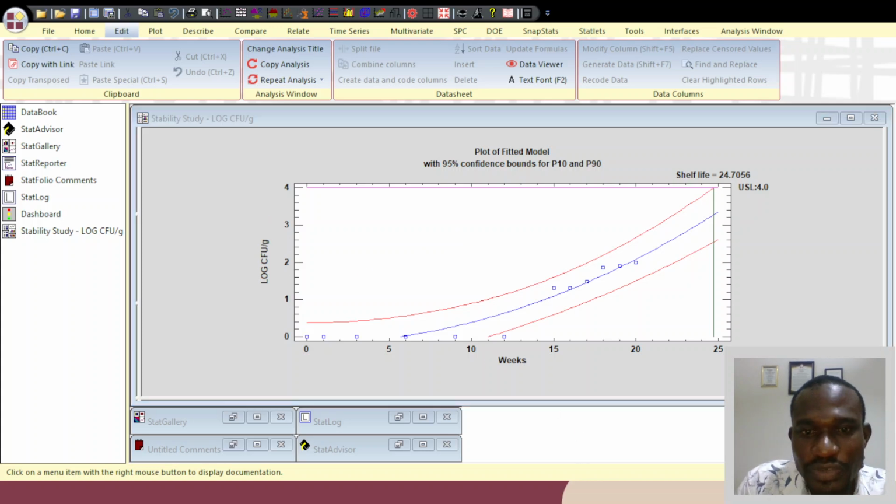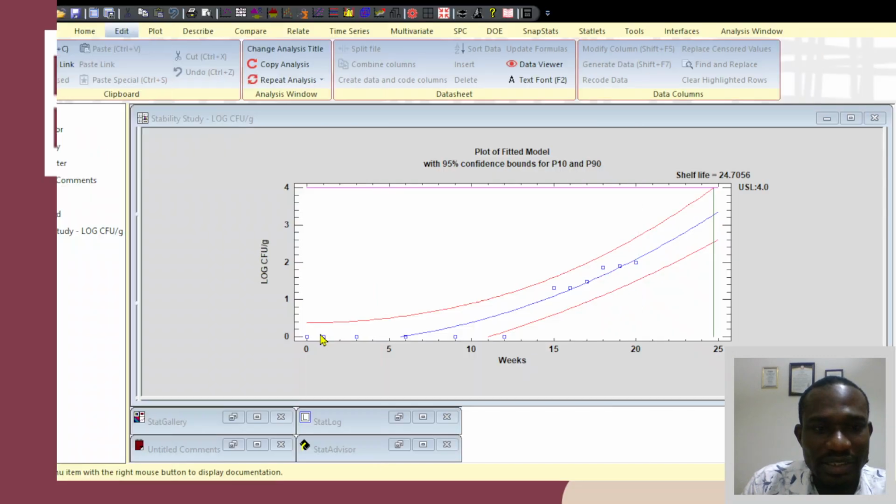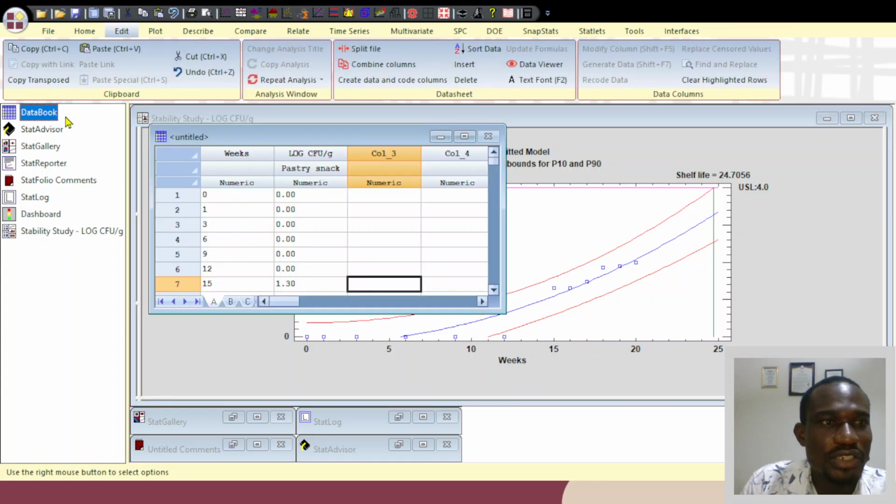I hope you found this video helpful. I hope that in subsequent videos I can explain how to go about working with multiple data, that's dealing with more than one response, and then how that can help you determine the shelf life of a product, and then also how we can use Microsoft Excel to go about shelf life. But just before I end the video, let me just explain this so that even if you are using Excel, you can work around something.